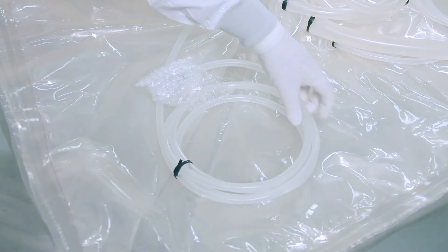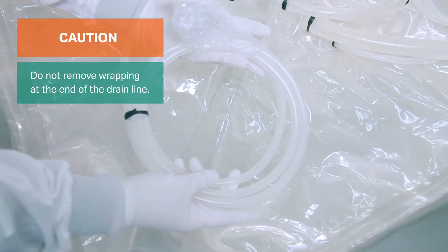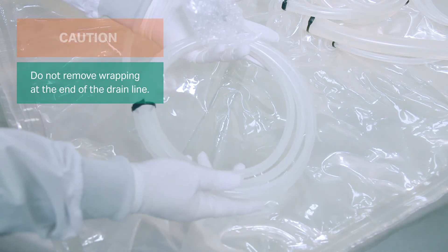Remove the bubble wrap from around the lines. Do not remove the zip ties or wrapping at the ends to keep them clean and untangled during installation.